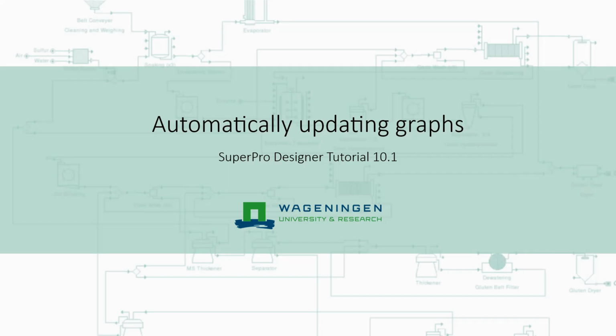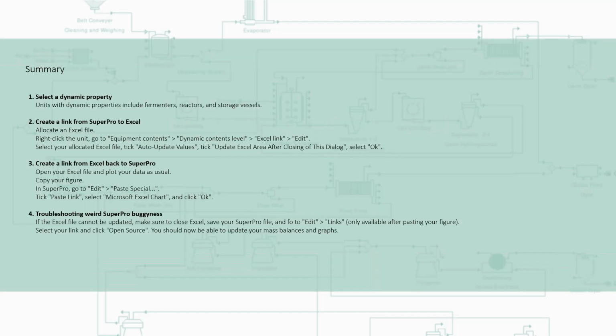In this video, I will show you how to create automatically updating graphs in SuperPro Designer. Currently on screen, you see a summary of the instructions in case you just need to quickly refresh your memory. In the rest of this video, I will explain these instructions step by step.